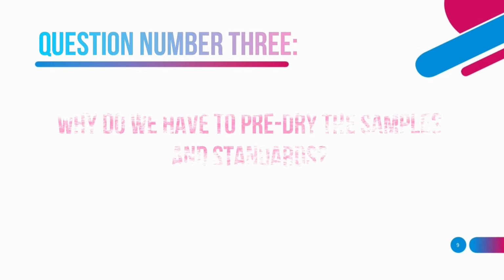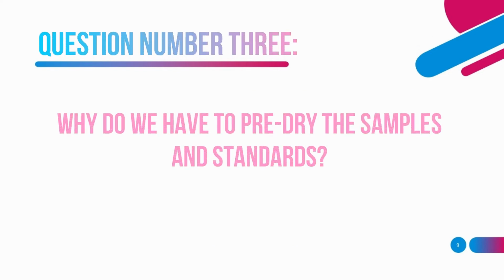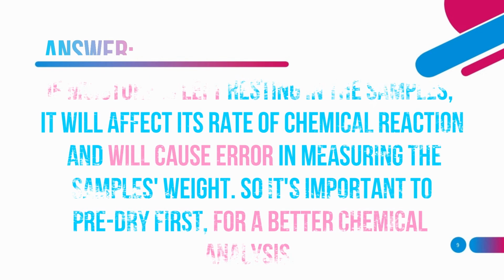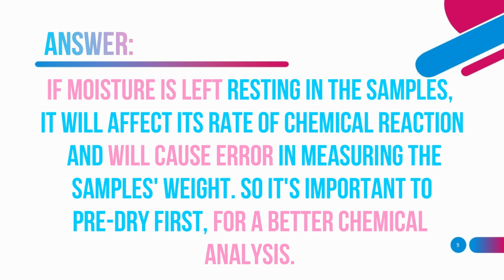Number 3. Why do we have to pre-dry the samples and the standards? If moisture is left resting in the samples, it will affect the rate of chemical reaction and will cause error in measuring the sample's weight. So it's better to pre-dry first for a better chemical analysis.